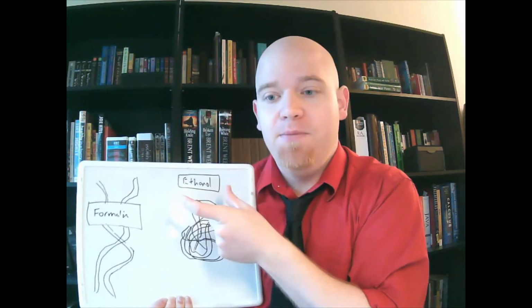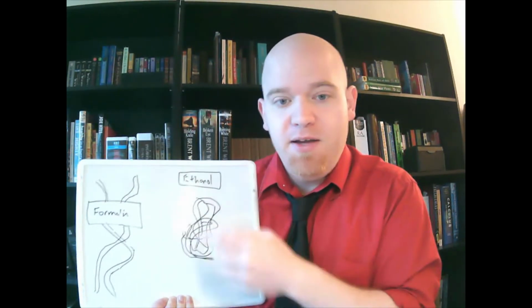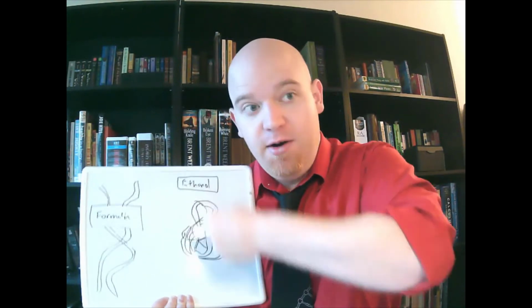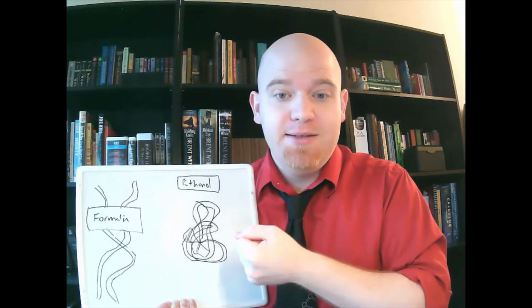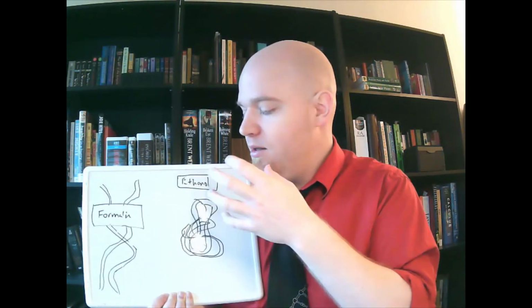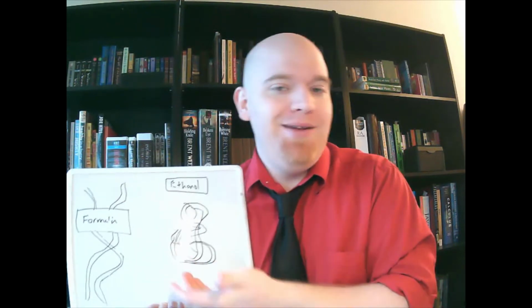With ethanol, if you put it in there for too long, these proteins keep balling up until they condense, till they're very, very dense, to the point where they become hard. When you hit something that's very, very dense, like a calcification, it doesn't cut well. And the same thing can happen with proteins if you leave them in ethanol for too long.